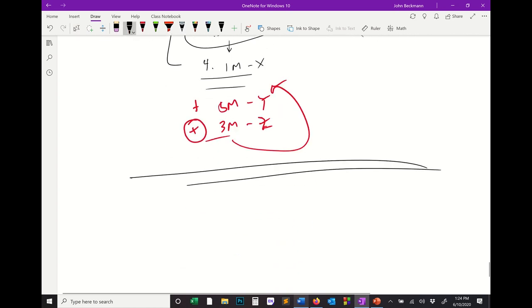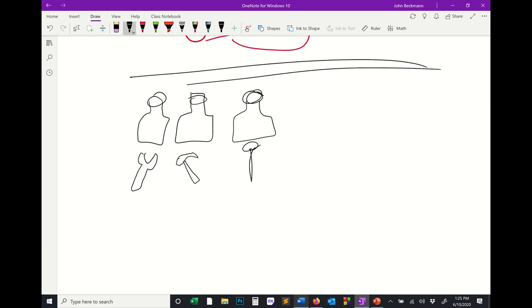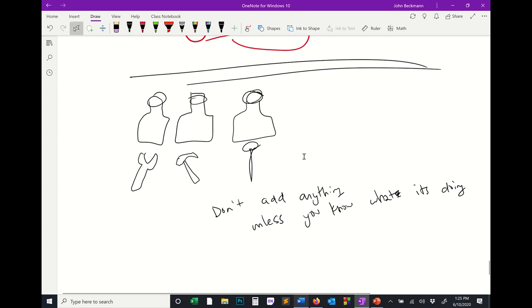To develop that knowledge, you need to view all your buffers as tools. Okay? Like I said at the beginning, you got a wrench. You got a hammer, you got a nail. This is an analogy. All your buffers do different things. And if you follow the rule where you don't add anything unless you know what it's doing, then you will learn what to put in what, how to change a recipe to make things work.